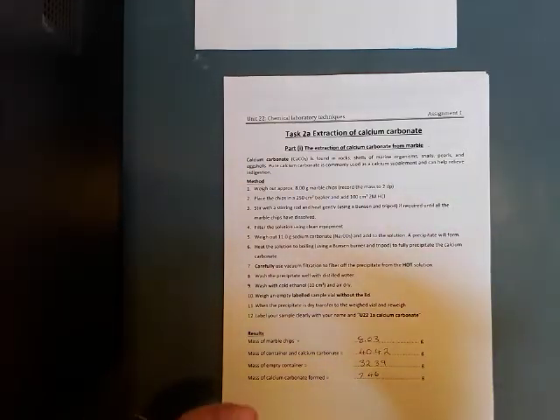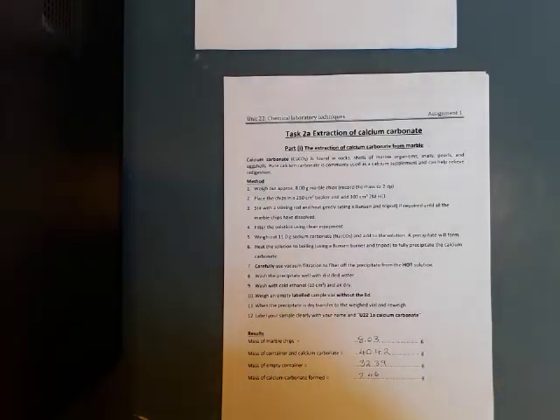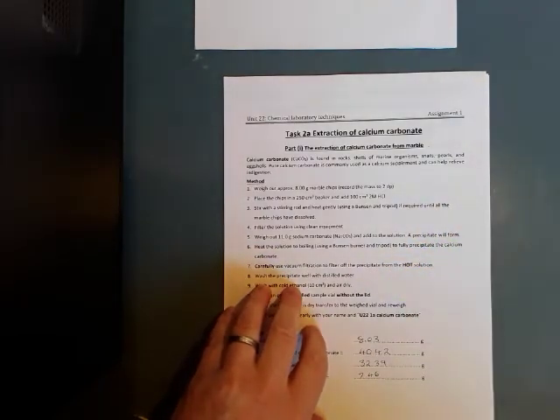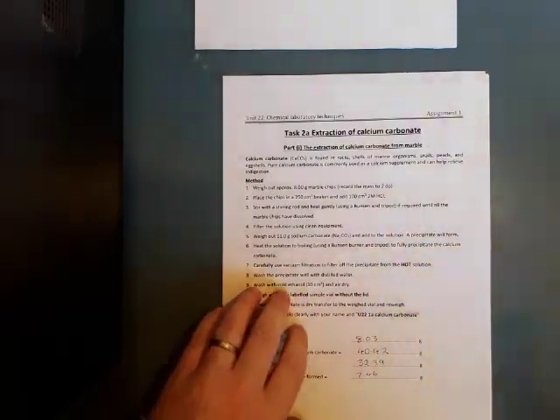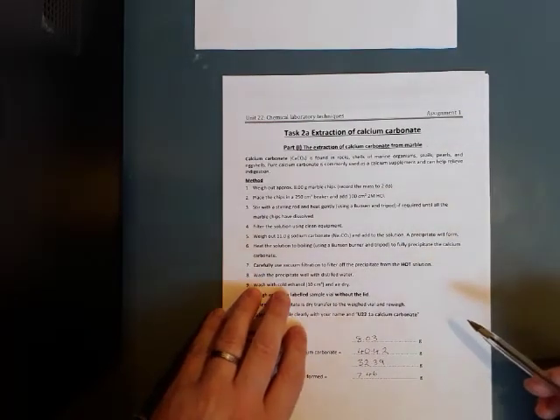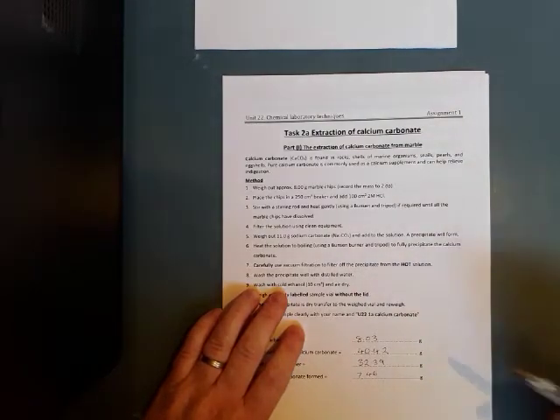Now, we're doing that so we can precipitate, but do we know that we've fully precipitated all of the calcium carbonate? At that stage, we don't. We're just following the method. So again, an issue there could be that we've not fully precipitated. So how could we potentially improve this? Once we filter the solution to get the precipitate, with the resulting liquid, we could add some more sodium carbonate to see if we get any further precipitation. And if we do, then obviously we can filter that again and extract some more of the calcium carbonate.